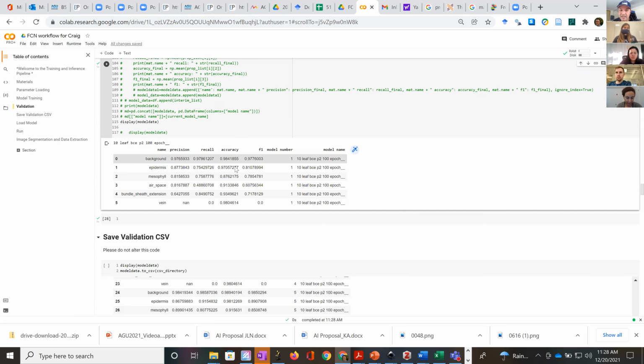The accuracy is quite high in general, but you can see there are some funny things with that. Veins occupy very little of any given image, right? So if it says there are no veins, the accuracy will be 98%. It can just say there are no veins, and you get high accuracy. So that's where recall and precision come in.